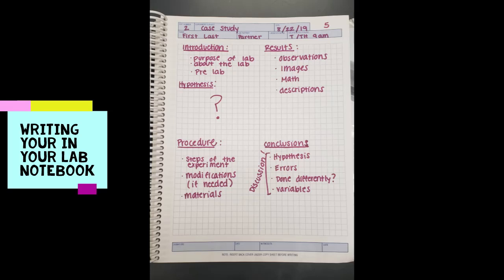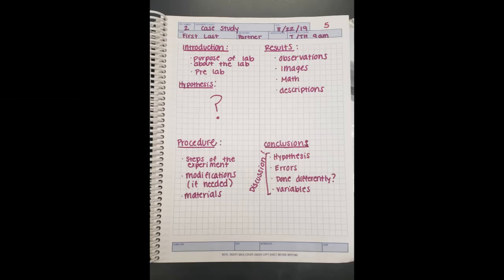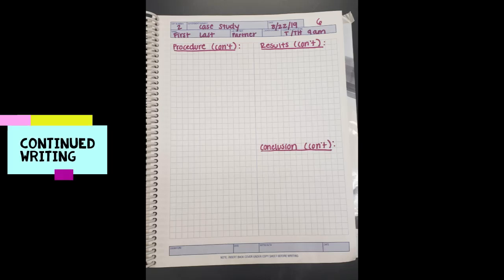All right, so the next page, I'm going to show you what it looks like when you have to continue. So if you have too much to write, here's what you do when you have to continue on to the next page. So this is what the continue page looks like.